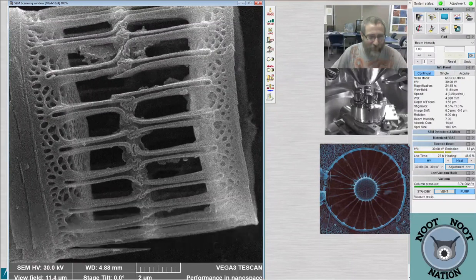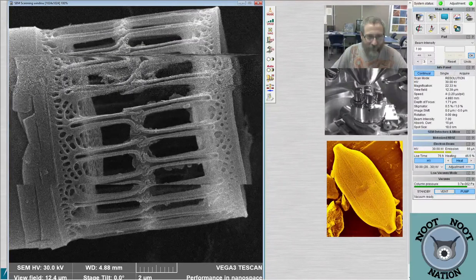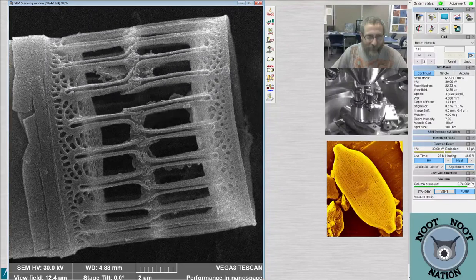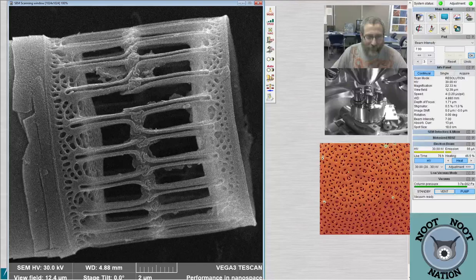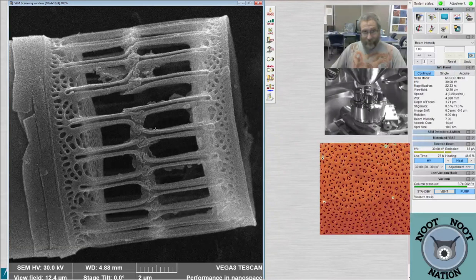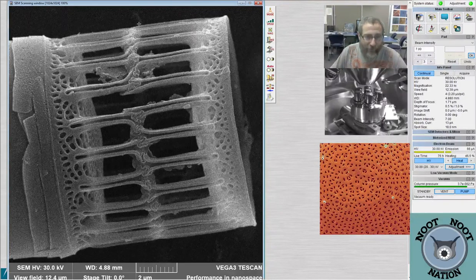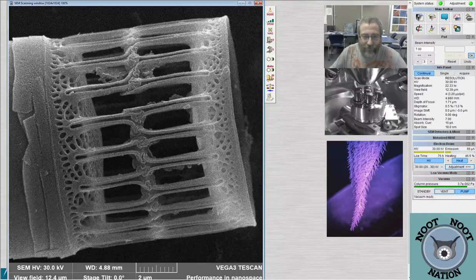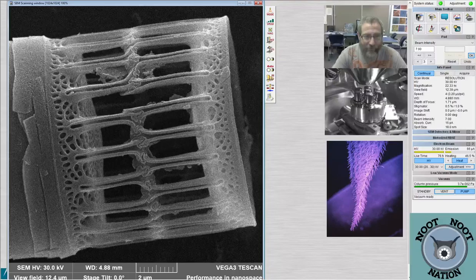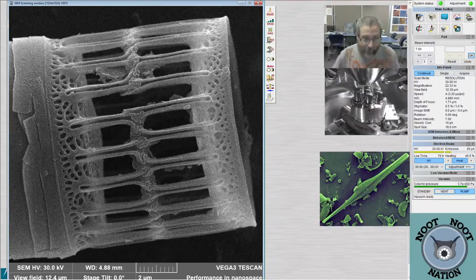It's super tiny. When these knuckling bits join together, where they grow in silica, do they start out close and join together and then grow the long extensions? Or do the long extensions grow until they finally form the knuckles? Do you know what I mean? Like, which part? All of it grew inside of a diatom. They grew like this, right? They didn't find each other and then attach, but rather they grew inside the cell like this.